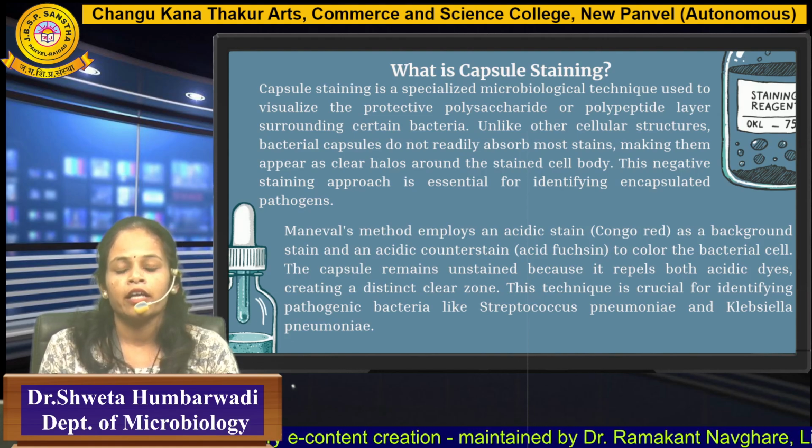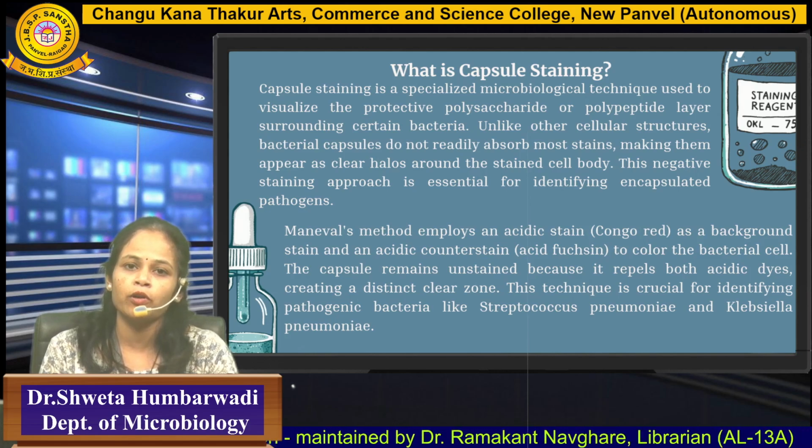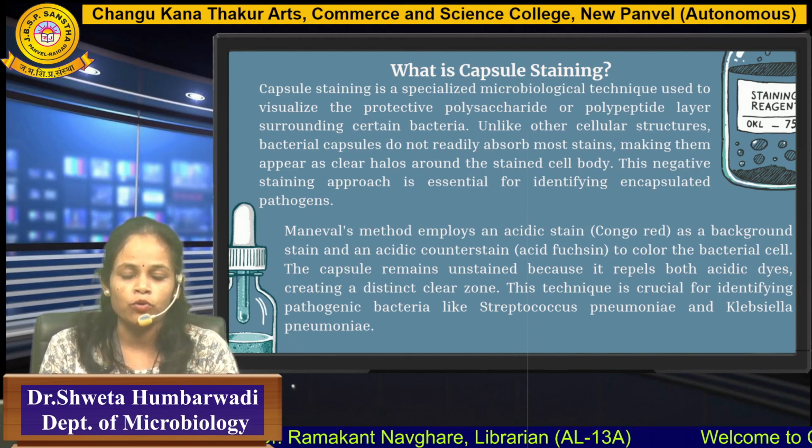For capsulated organisms we can use this technique, and examples of these organisms are Staphylococcus, Klebsiella, Streptococcus pneumoniae, etc.